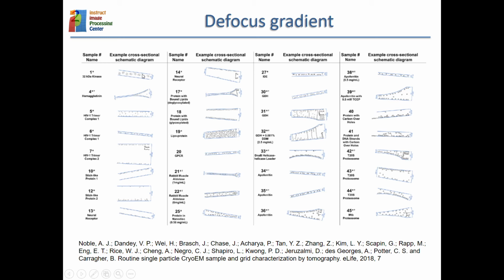So particles here had different defocus from particles there, or you had this disposition in which some particles have a defocus, and these other particles have another defocus. Within a layer, you might have a whole distribution of particles, and every particle had a different height within the ice layer, and different height means different defocus.